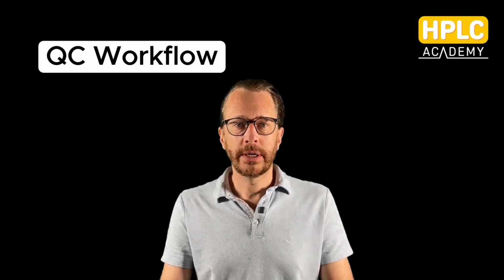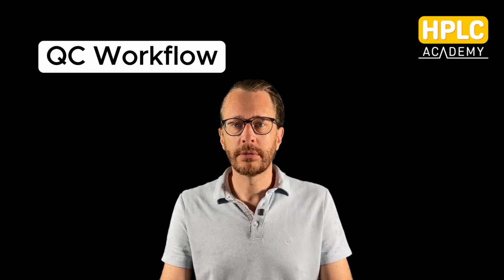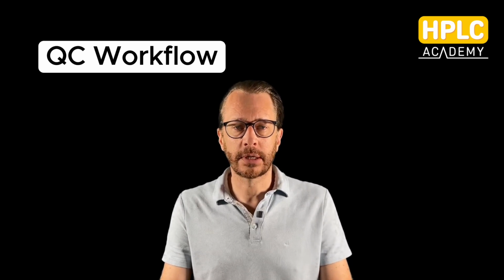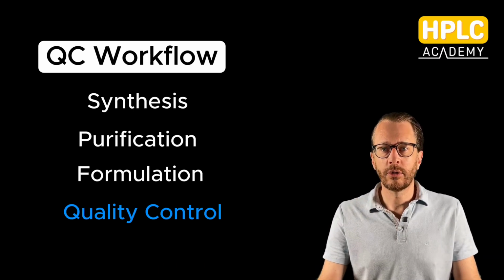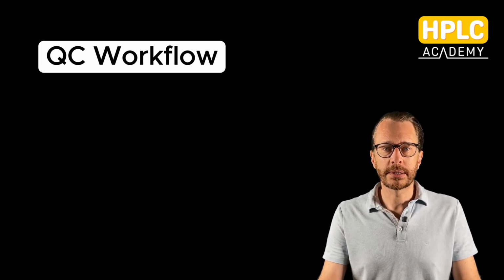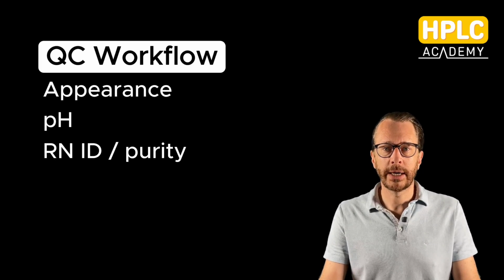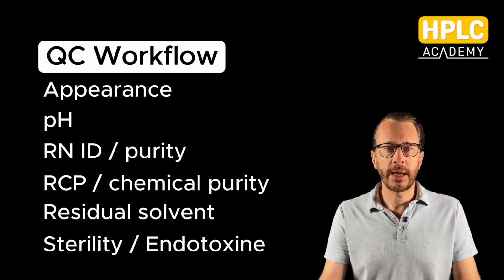Now, where does radio-HPLC fit in the overall QC workflow? Radiopharmaceutical production follows a strict sequence: synthesis, purification, formulation, and then quality control before patient release. The QC test panel typically includes appearance, pH, radionuclide identity and purity, radiochemical purity, chemical purity, residual solvent, sterility, and bacterial endotoxin.